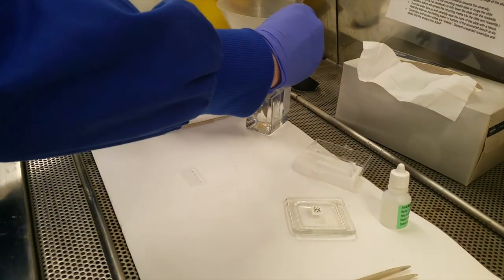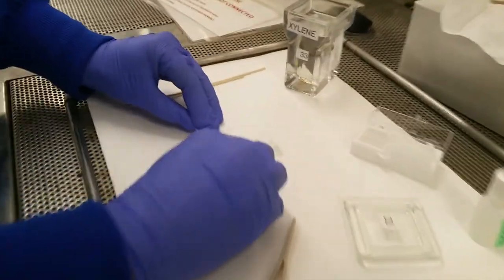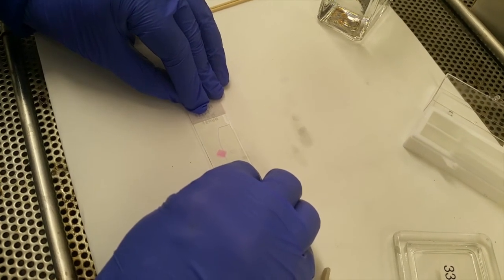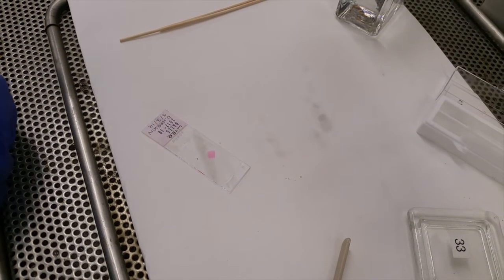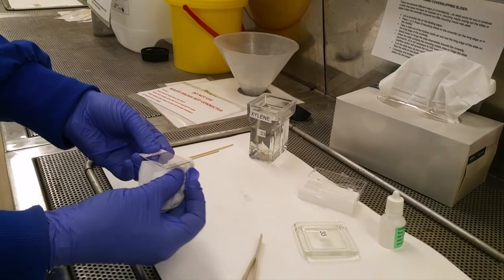So then moving promptly, pull the slide out, touch the toes, lay it on the side, bring it to the edge and make a hinge. Gradually close the hinge until you get connection with the mounting media coming across to about 50% or so, thumbnails underneath, and then flipping it back over, and then let the capillary action draw the mounting medium across the slide. Because there's xylene on the slide and a good amount of xylene still in the mounting medium, it's just flowing nicely.